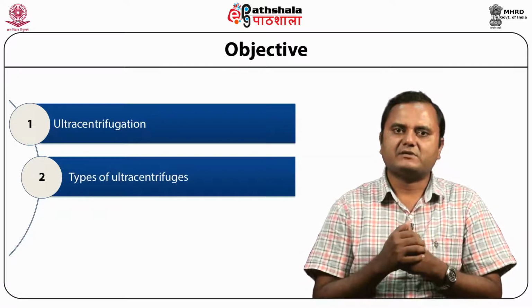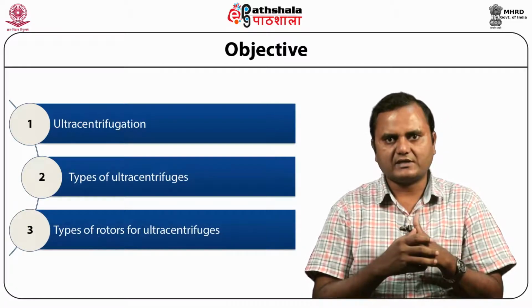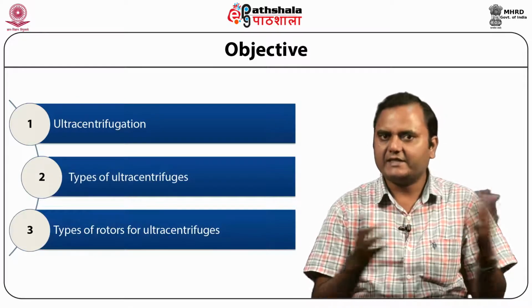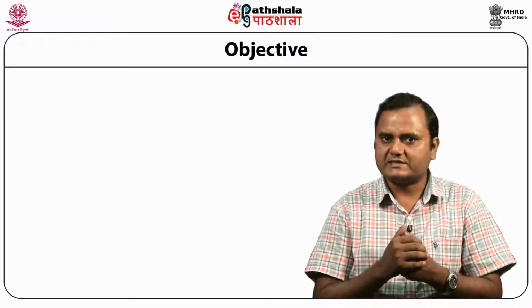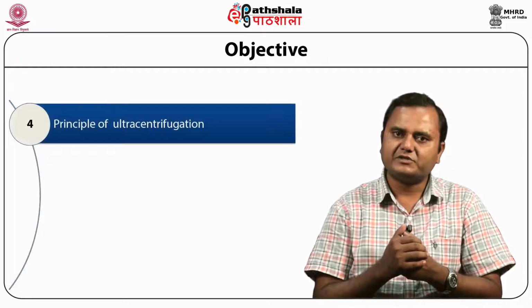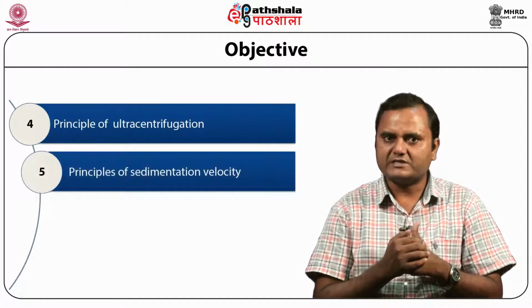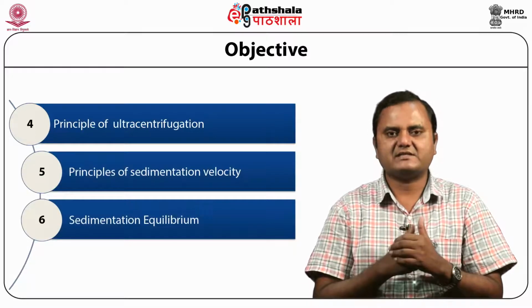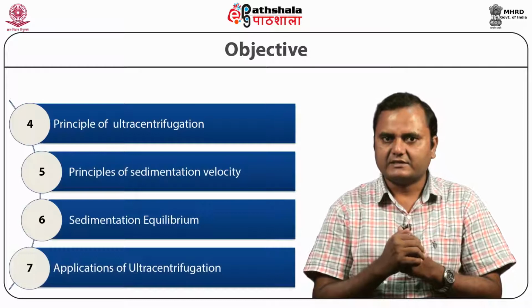Then we discuss the types of rotors for the ultracentrifuge, because the rotors used in ultracentrifugation are different from normal centrifugation and they have some advanced features, of course. Then we discuss the principle of ultracentrifugation techniques, based on the principle of sedimentation velocity and sedimentation equilibrium. And at last we discuss the applications of ultracentrifugation techniques.